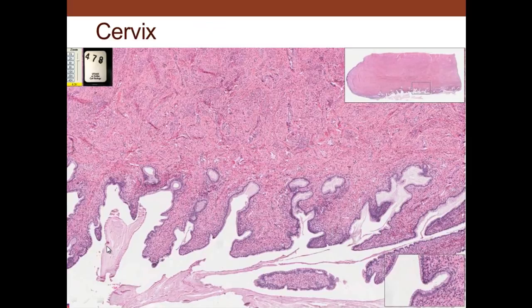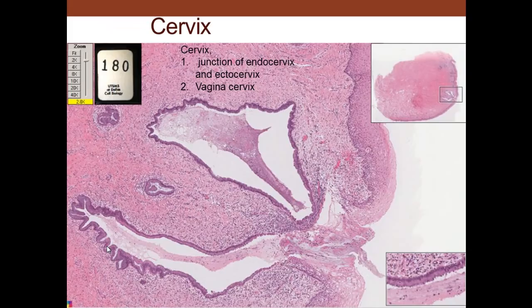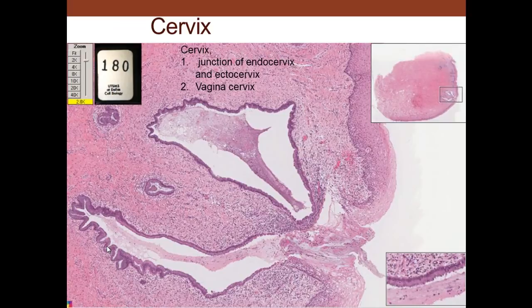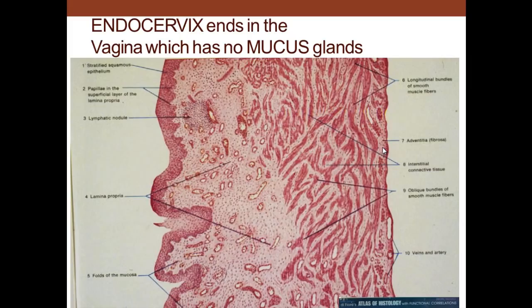The cervical mucus closes up the opening during the time that is not close to ovulation. On the inside you have columnar epithelium with secretions, but on the outside of the cervix you have stratified squamous epithelium — it abruptly changes. This junction is between the endocervix and the exocervix, the exocervix being the part that projects into the vagina. The vagina has stratified squamous epithelium, connective tissue, and some smooth muscle fibers, but note there are no mucus glands in the vagina itself.